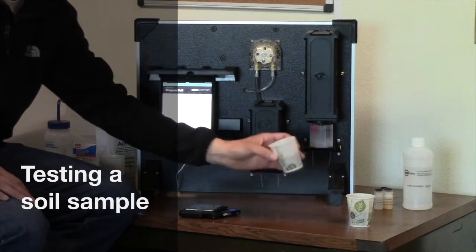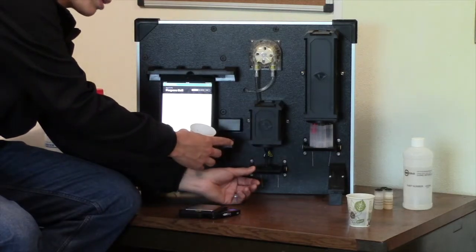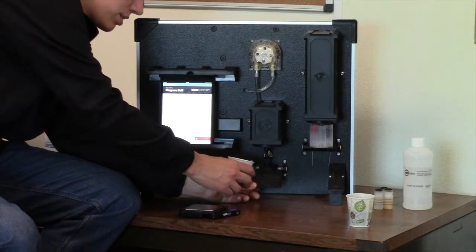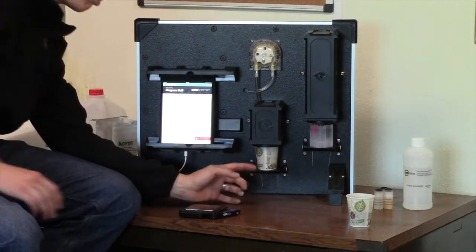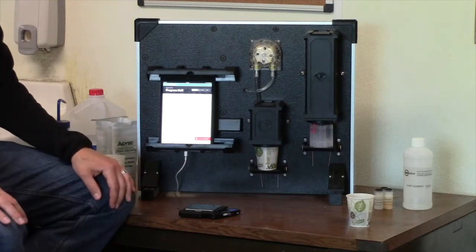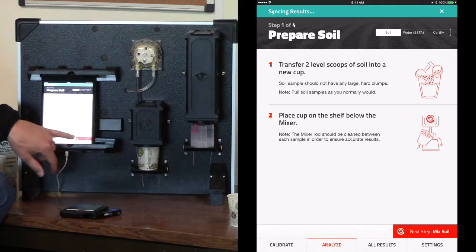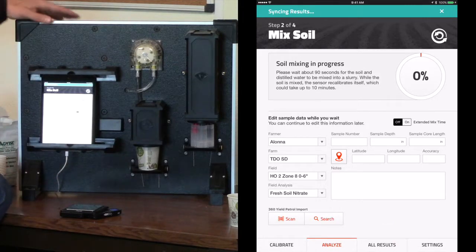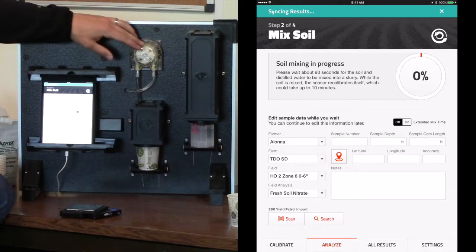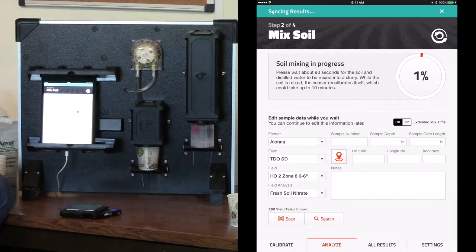Now that we have our samples prepared, we can start by placing the sample on the mixing station. Again, this is done by pulling back the lever action stage, placing the sample over the mixing paddle, and then releasing the stage. At that point, you can click Mix Soil. This will begin to pull water from the storage tank and release it into the cup. Again, the idea here is that we're creating a 1-to-1 ratio between soil and water.